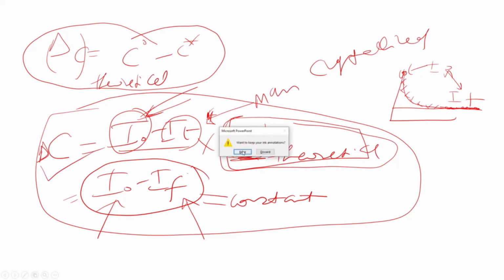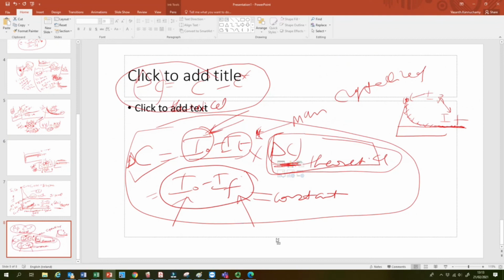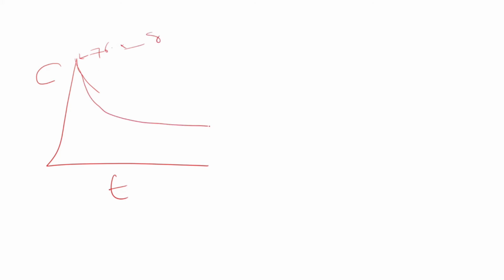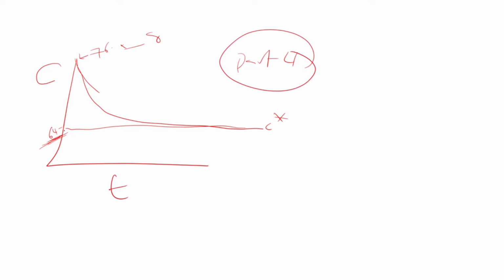And once you have that, then you can calculate concentration at any time. So time versus concentration, we can calculate. We started from 76 point some grams, I don't remember exactly, and then it will reach saturation, the solubility. So solubility concentration will be roughly around 64, I think. I don't remember exactly, but in part 4 of the lab report I clearly mentioned what the solubility value is.